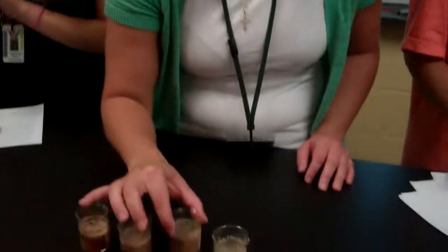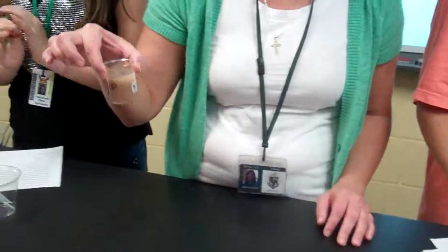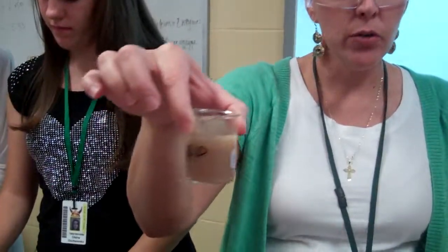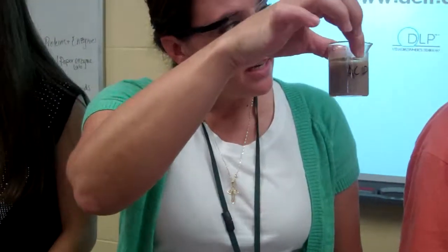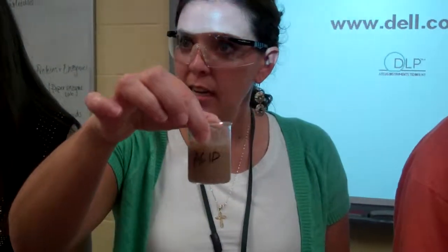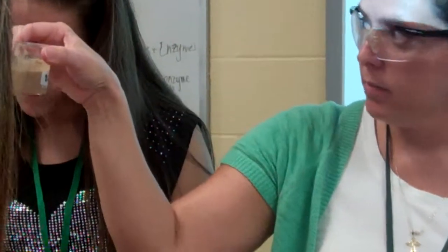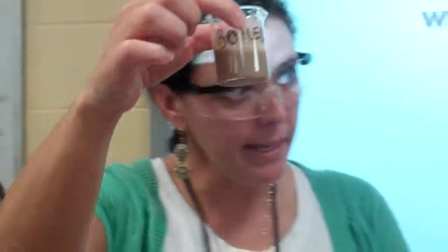Alright, this next one is liver that has been soaked in acid. So same idea, I took raw liver and then I poured acid on it. I poured HCl on it. And then this last one, again, same idea. I had raw liver. This time I boiled it. So I just put it on a hot plate and let it boil away.